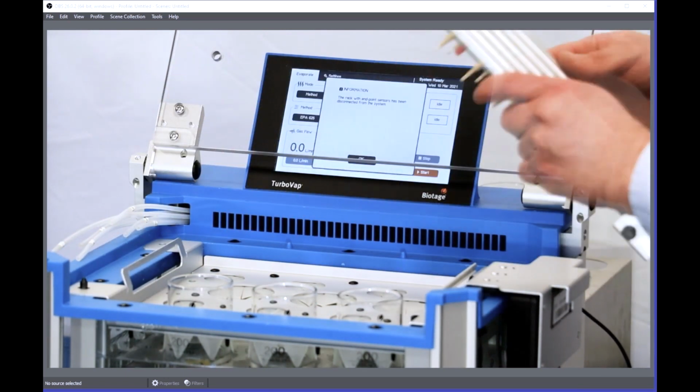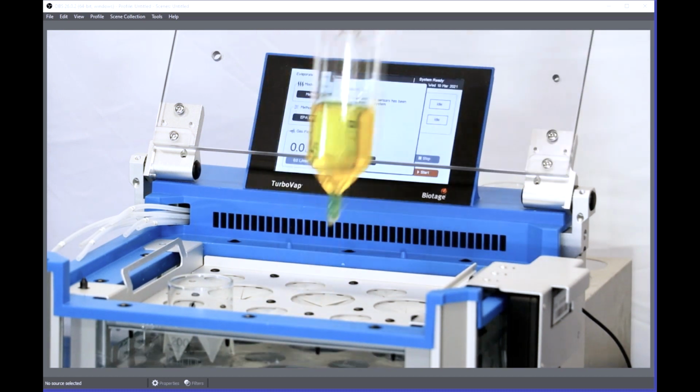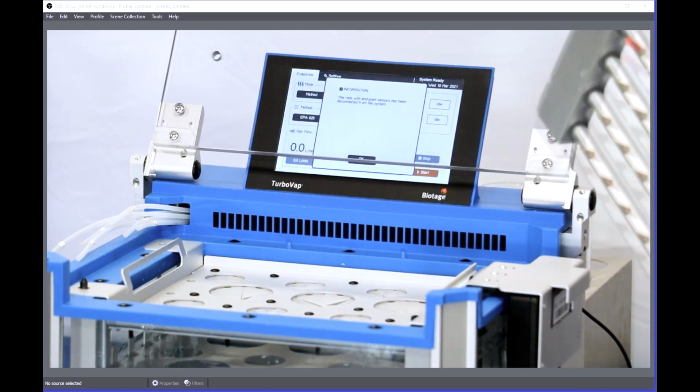I will have to remove my tubes. You would be afraid I'm not going to apply that hard. No, that's a full demo. We can swap a manifold easily. I will take out my tubes.